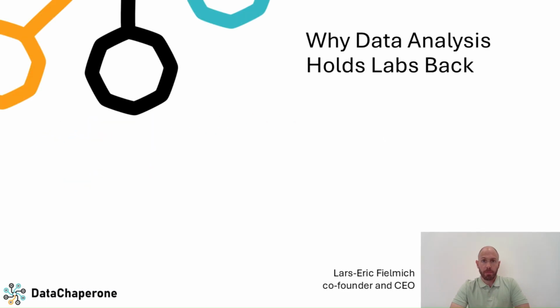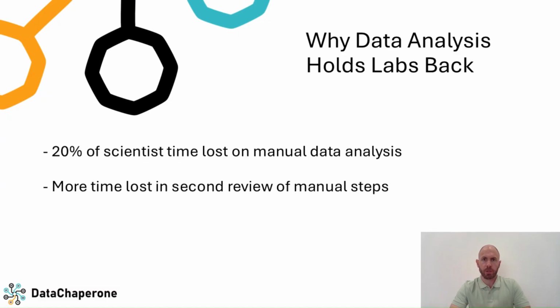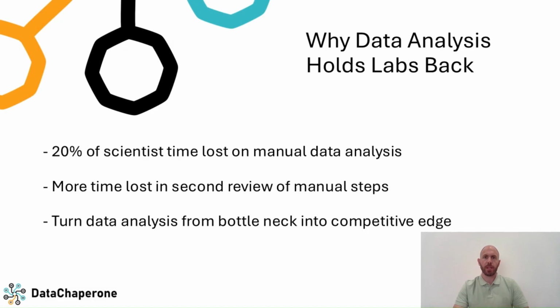In life science companies, scientists spend a day a week on repetitive and manual steps for analysis and reporting. And because all this manual work needs to be checked and verified, managers lose even more time and precious resources. DataChaperone provides a platform that we fill with your workflows so your analyses become standardized, automated, traceable, so you can focus on your innovations. Nova will show you an example.